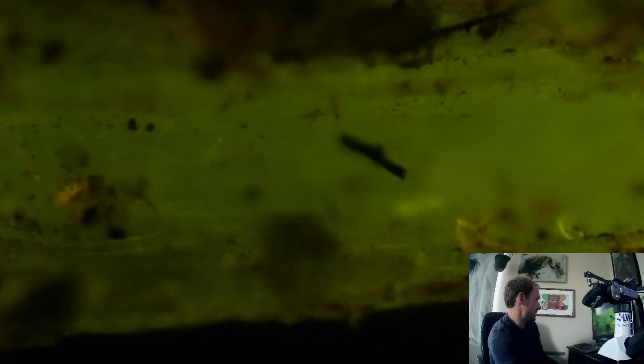Here, bring that over. It kind of looks like something. So you can kind of tell, okay, we're out of focus above the root. There's the top of the root in focus. So right there, and now we're going into the root. So you can kind of tell with the focus what's on top and what's inside. Alright, moving on. Yeah, let's look at these couple of bright glowing spots. Try to get the best focus in on them.